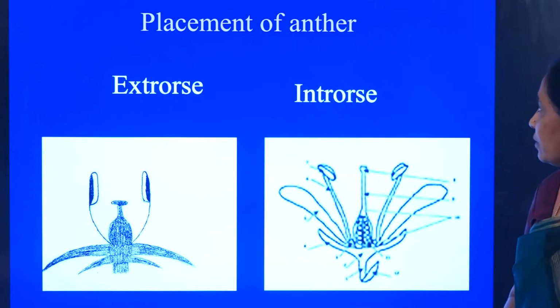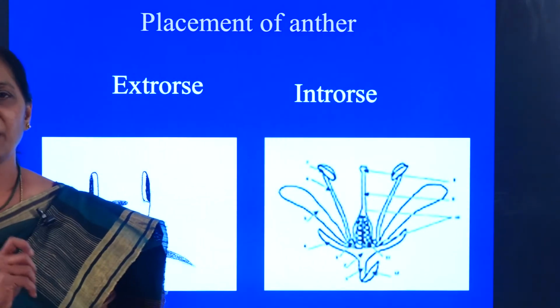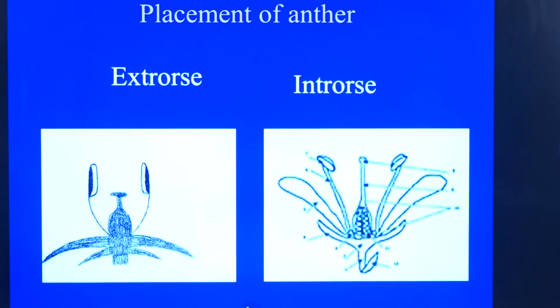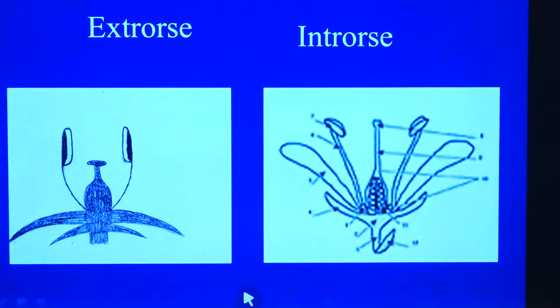See, when we observe this, the placement of the anther, how the anther is placed, that's very important here. When we observe the placement of the anther, it is extrorse or introrse.